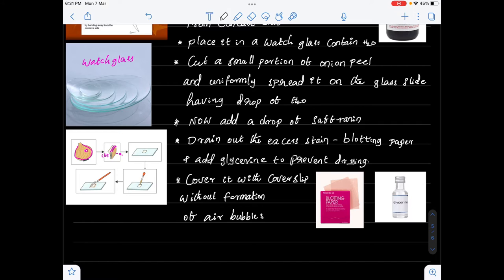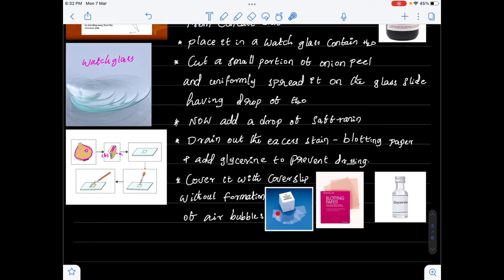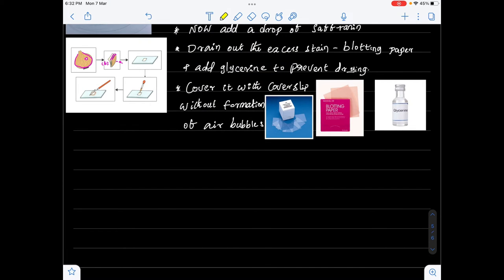Now let me show you the cover slip. Here are the cover slips — they are all transparent. After preparation of the material, the cover slip is slowly placed on the material without formation of air bubbles.